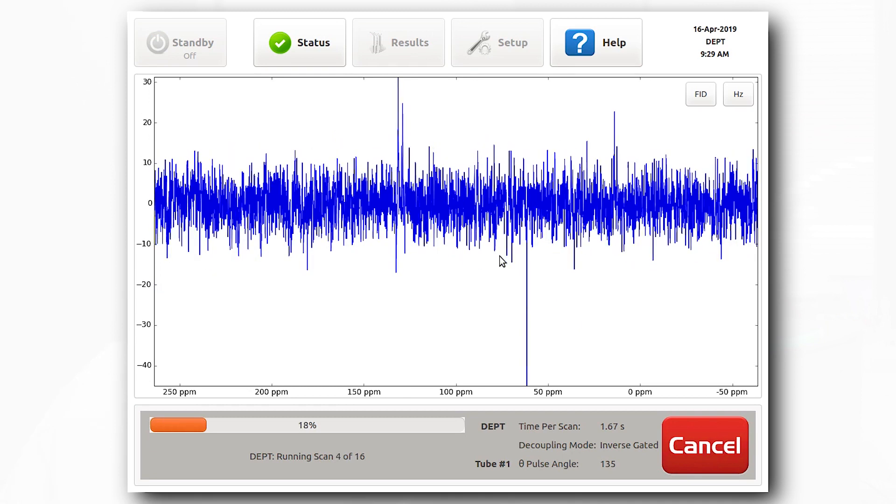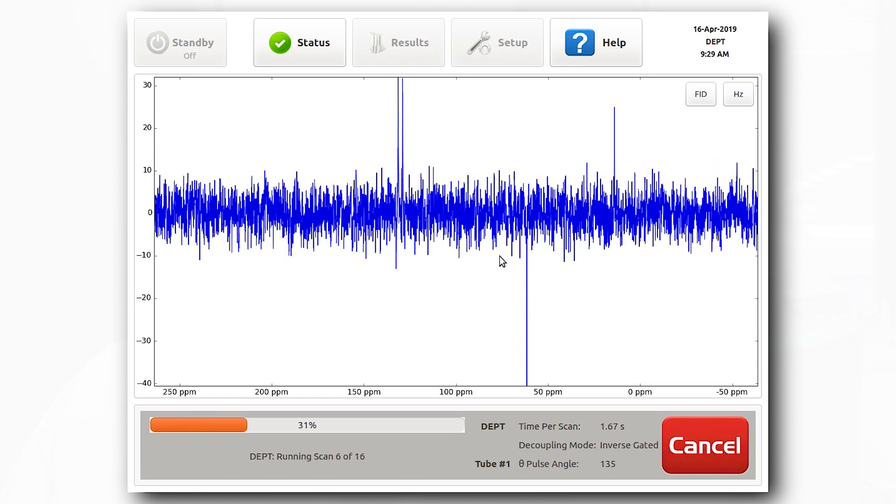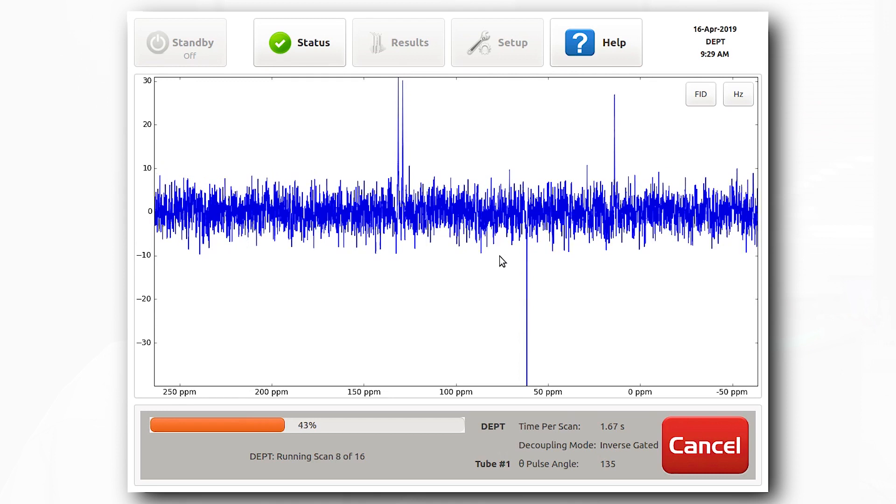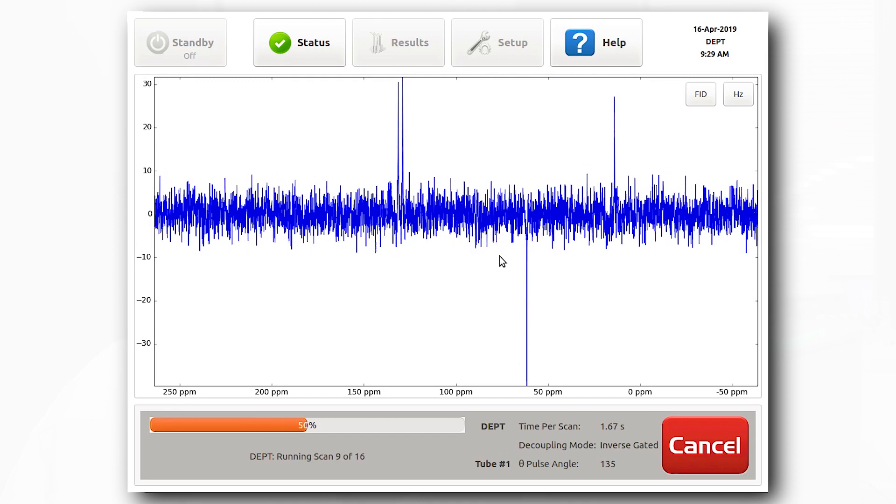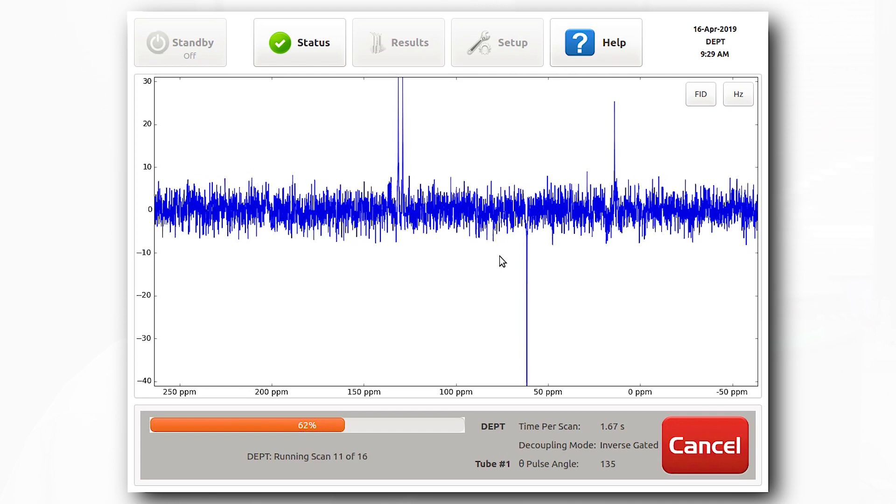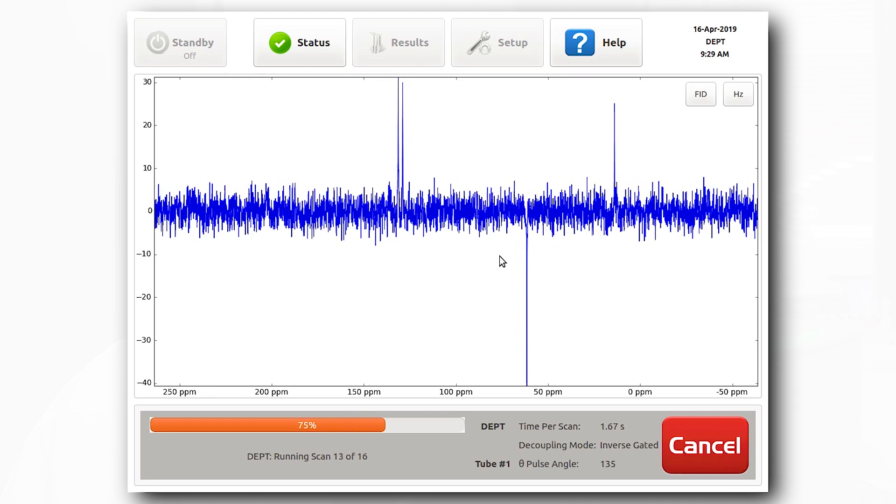In DEPT 135, CH3 and CH centers appear with positive intensities, while CH2 centers will appear with negative intensities.